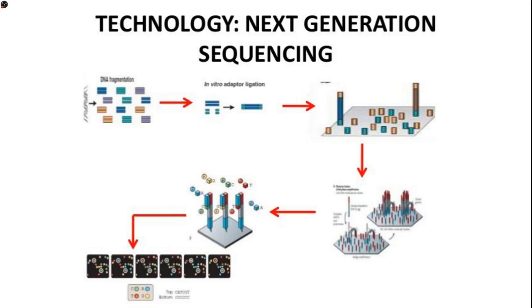Through this series of tutorials, we will try to get a feel of what exactly biological data is and how to generate your own biological big data. The thing is, you do not need to install any special operating system or sophisticated software for this task, for we have already taken care of everything.